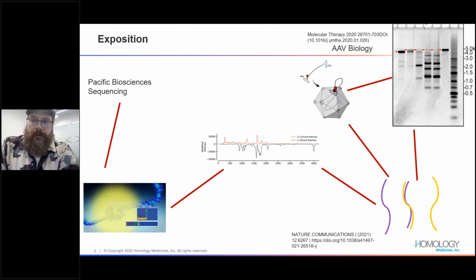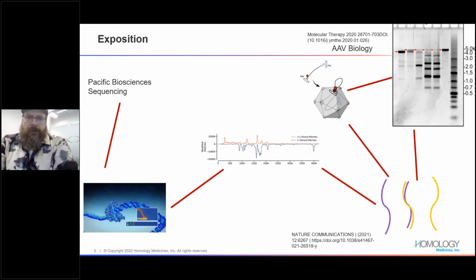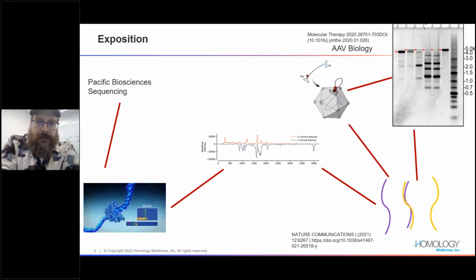its activity. On the other side of the page is the uniqueness of the AAV's biology, right? So you've got your virus, you want to put it in its little capsid, and then in the upper right, you can see a good example of an alkali gel showing you the differing lanes. You've got a lane that's close to 5 kb, so that's indicative of a fully loaded capsid. Whereas in your other lanes you have these smaller fragments, and that's to visualize for everyone the idea of these partially filled capsids.